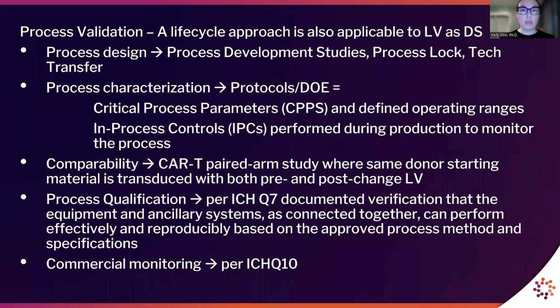Similar to a CAR-T drug product, process validation should also be performed for lentiviral vector. Process validation is the sum of studies carried out over the clinical development of a drug substance, which contribute to the overall process knowledge. This begins with the process design phase, which is information gained in the activities leading up to GMP production. Process design is composed of activities like process development studies, demonstration runs, process lock runs, and tech transfer.